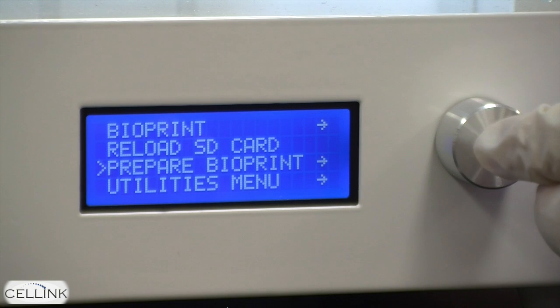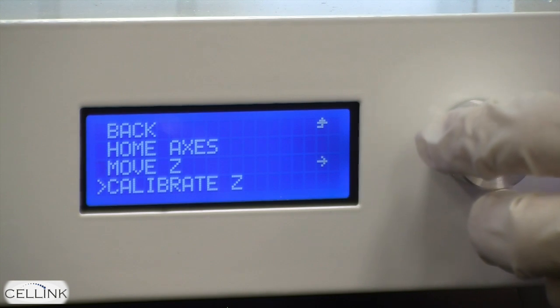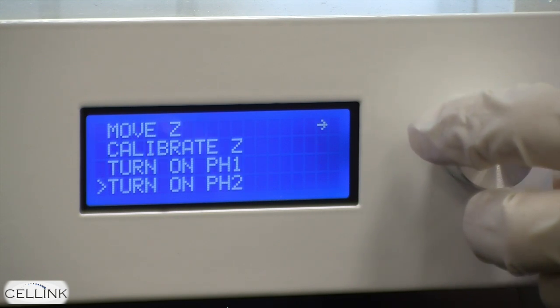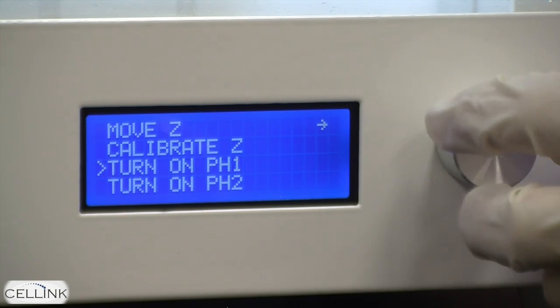Below this is the prepare bioprint menu. The first three options in this menu — home axes, move Z, and calibrate Z — are used in calibrating the bioprinter, which you can find in another video. Below that are turn on printhead 1 and turn on printhead 2, which are used to allow pressure to enter both printheads.